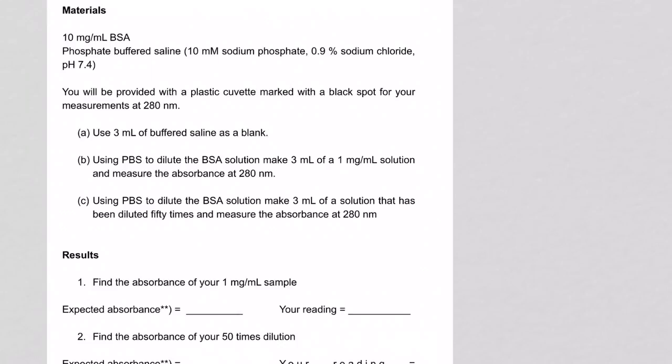This time, the light that we use to measure our substance actually is different from the first time. The first time we used light at a wavelength of around 400 nanometers. Anyone know what color 400 nanometers is, roughly? It's about yellowish. This time, for the BSA, we use UV light, ultraviolet light. And this ultraviolet light actually requires a different kind of cuvette.